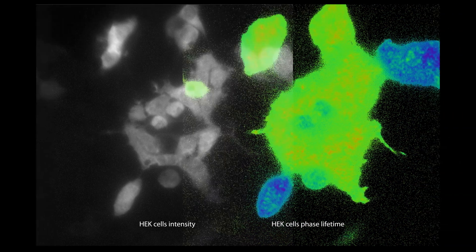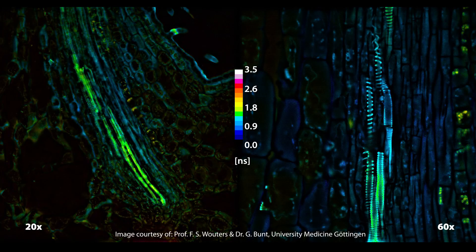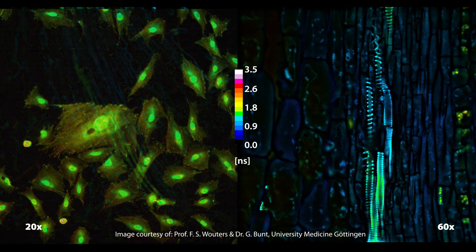At a maximum modulation frequency of 40 MHz, minimum half-period integration intervals of 12.5 nanoseconds can be achieved. This is what makes the PCO FLIM camera a versatile frequency domain FLIM system.